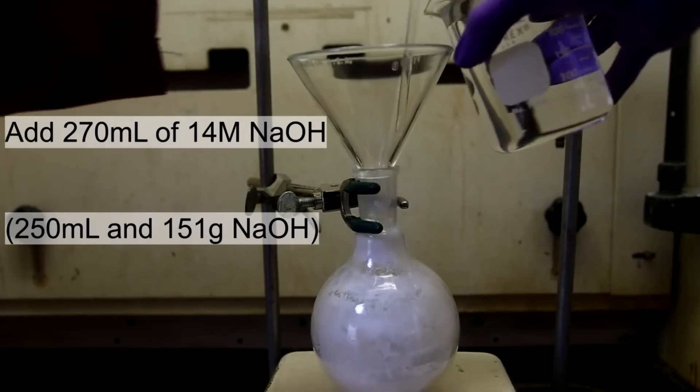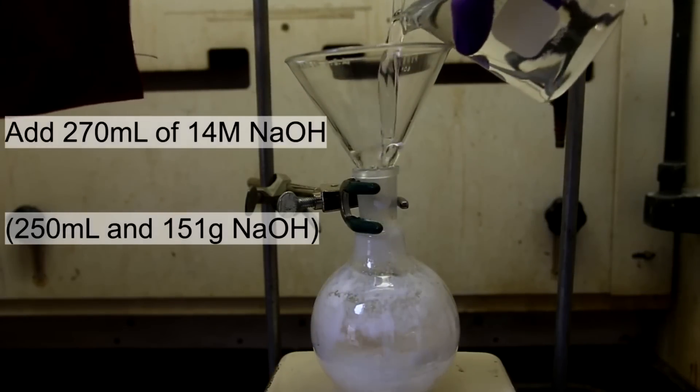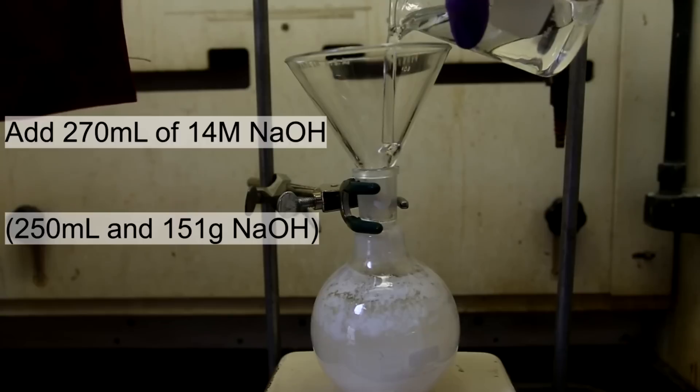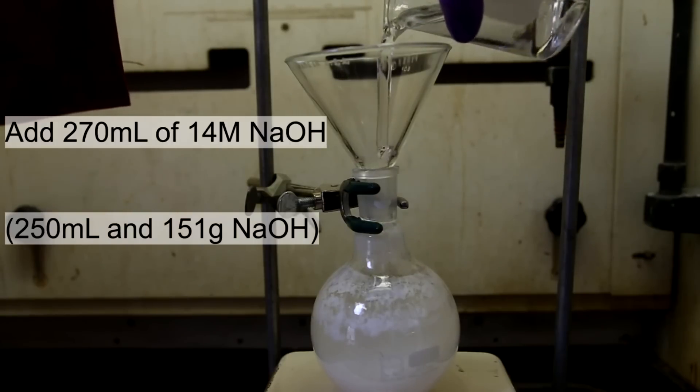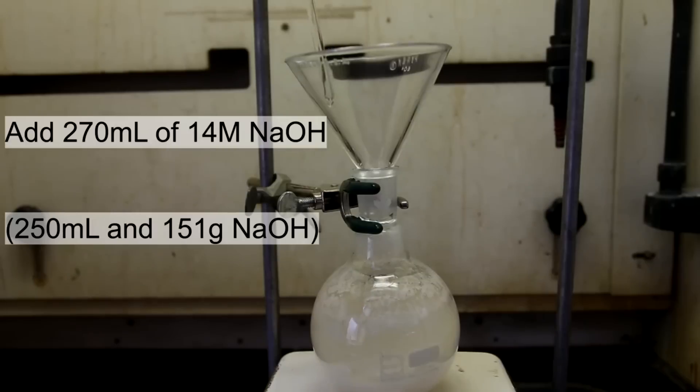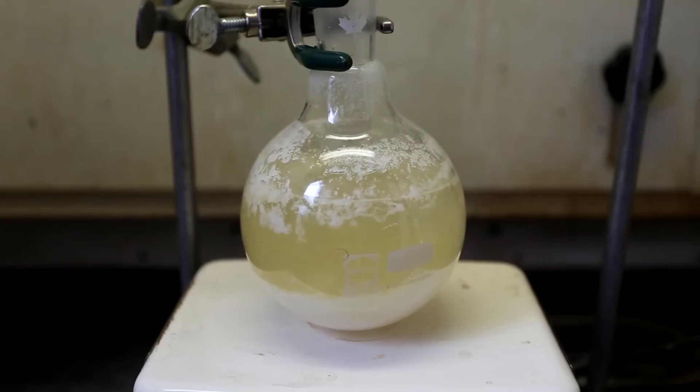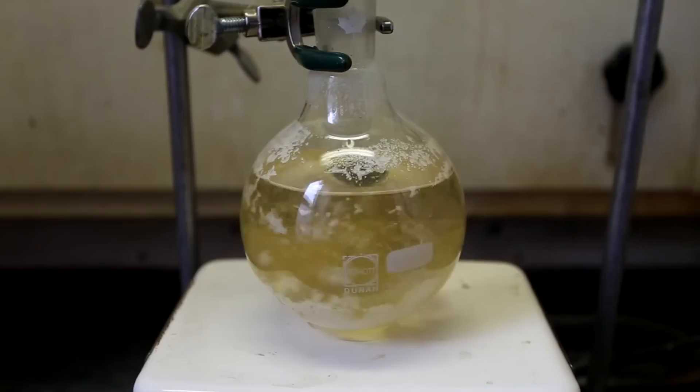To the round bottom flask, I added 270 milliliters of 14 molar sodium hydroxide. An excess of sodium hydroxide is used to make sure that the reaction goes to completion. The solution was stirred and eventually all of the acetylsalicylic acid powder was dissolved into the sodium hydroxide solution. The solution became a yellow color and heated up a lot and became quite hot.